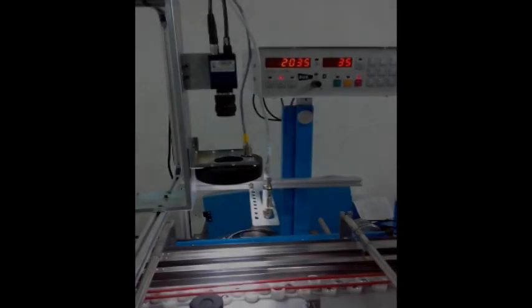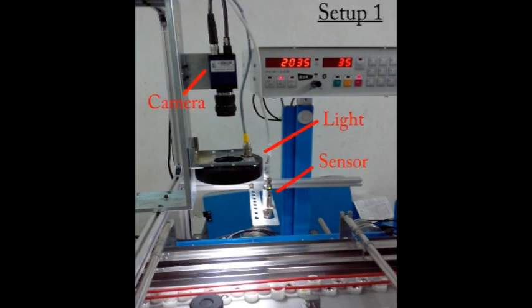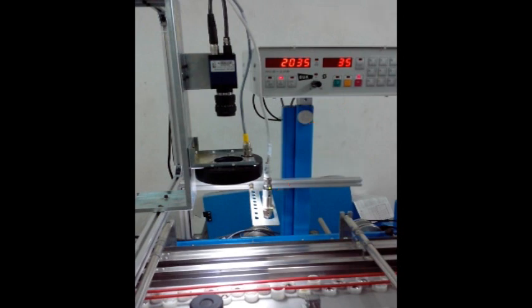In Setup 1, the camera, ring light, and sensor combination are used to capture well-defined clear images of the moving labels.